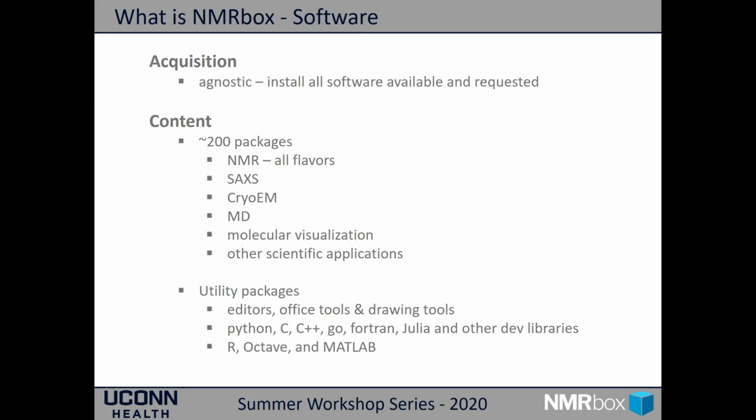And we also have Octave, and very recently, we have finally been able to utilize the University of Connecticut's MATLAB license, and MATLAB is now included for all users inside NMRbox. So all users have access to MATLAB. That's very recent, that's come about in the last few weeks.